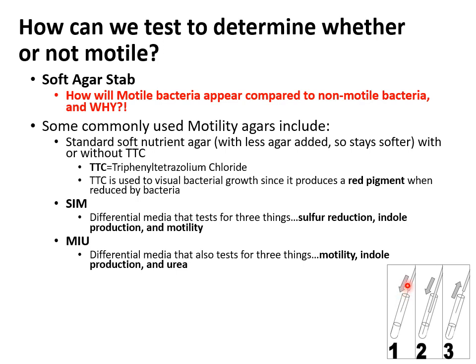What you do is you take an inoculation needle, a straight metal needle, you dip that into bacteria, and then you gently and carefully stab that through the center of the agar and gently pull directly up, without shaking, without moving. So you stab once and pull back exactly how you had stabbed into that media. And then you just placed that bacteria in a straight line in the center of that agar.